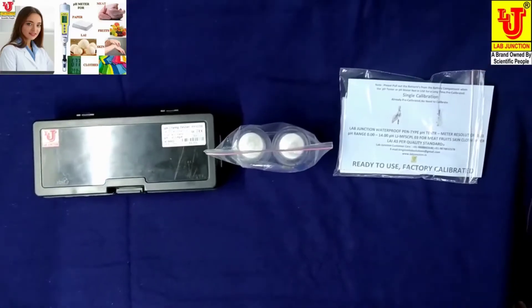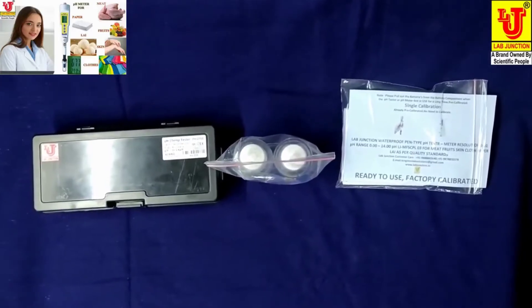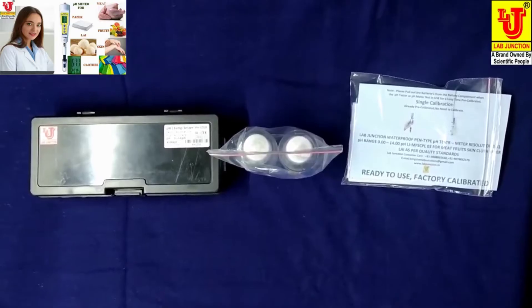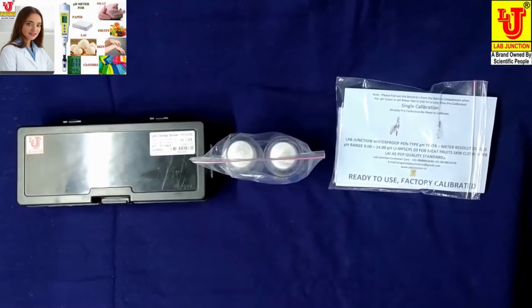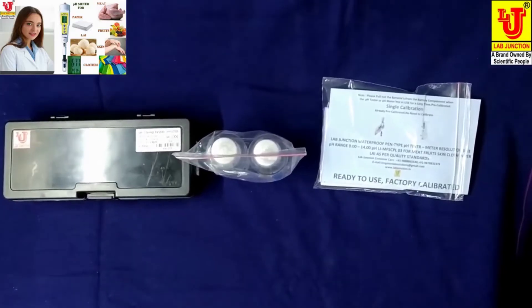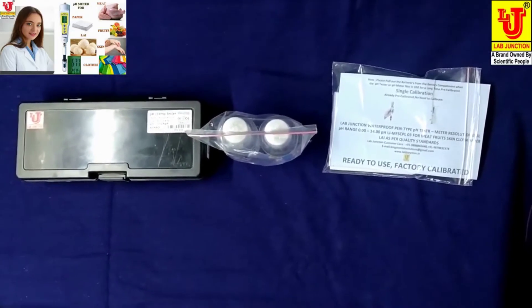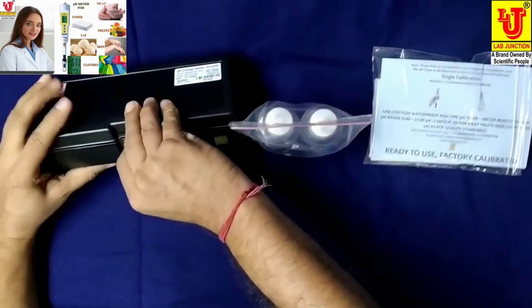Lab Junction waterproof pen-type pH tester meter, resolution 0.01 pH, range 0-14 pH, model LJ-MFS-CPL-03. Specially designed for meat, fruits, skin, cloth, paper, and lye. As per quality standards, this is our main meter — I am opening the box.